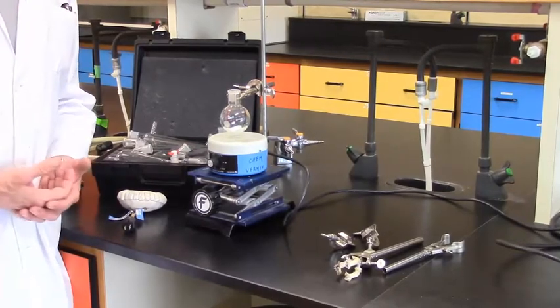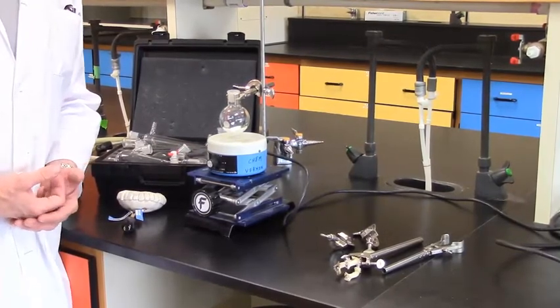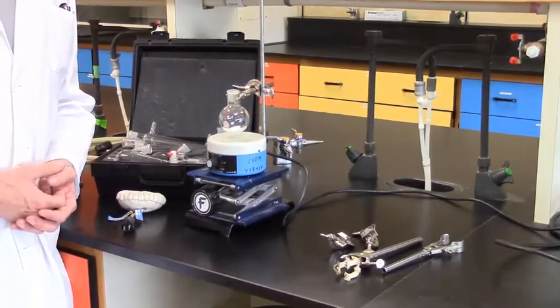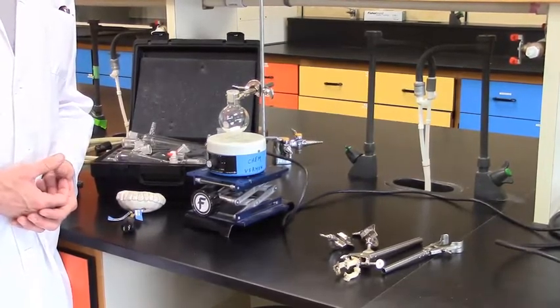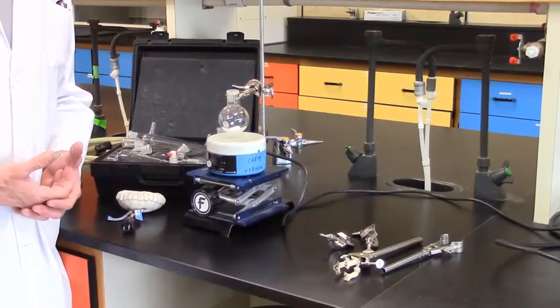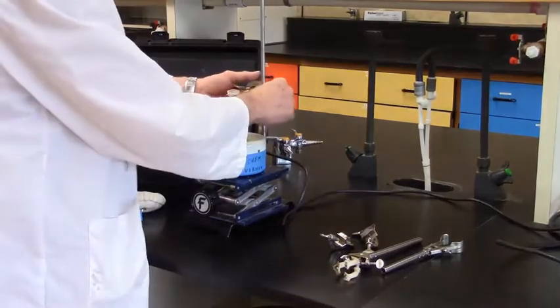Diethyl ether, a flammable organic solvent that doesn't smell that nice, boils at about 36-37 degrees Celsius. It doesn't require a lot of heat. So, our heating sources can be quite mild. In some instances, simply hot water is sufficient.